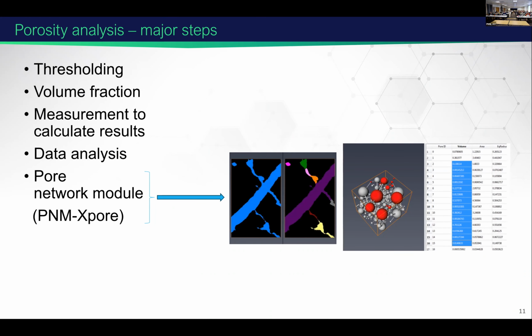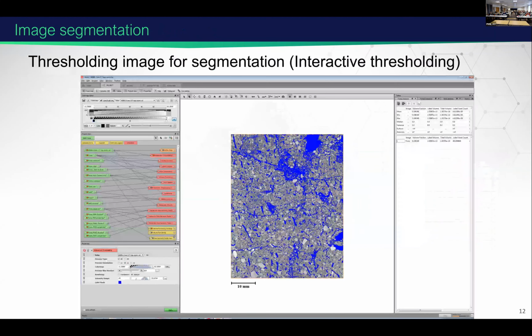Then finally, to the same segmented pores, we attach the axis connectivity, which gives you only the connected pores out of all the pores, and we can subtract the unconnected or isolated pores. Then we do the pore connectivity, which is helpful for us to get the flow and transport properties. So these are the slides that I already showed.